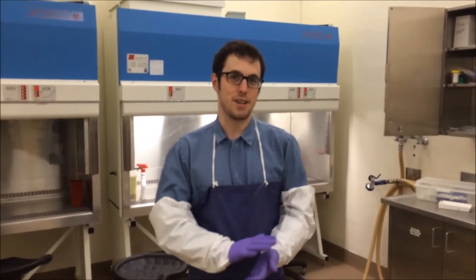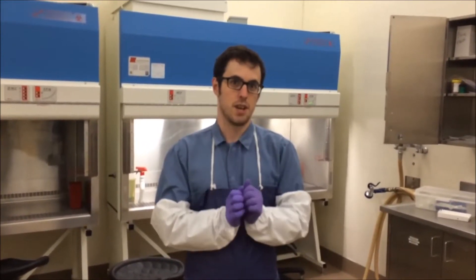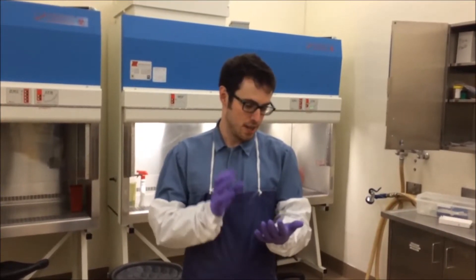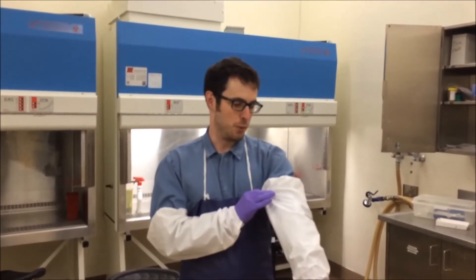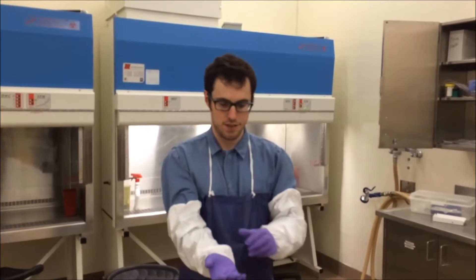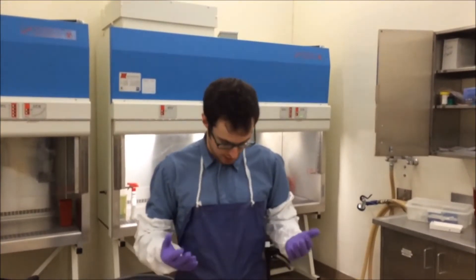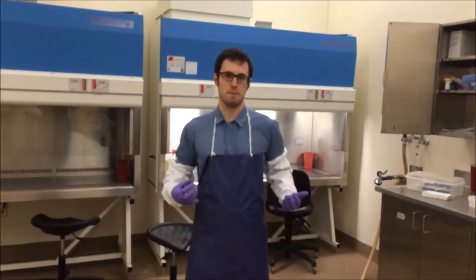So for every bat necropsy that comes in, we are triple-gloved. We wear cut-resistant gloves just to prevent any sharp penetrating wounds to prevent the spread of rabies. We wear arm sleeves just to prevent further contamination of our coveralls and we're also wearing a gown.